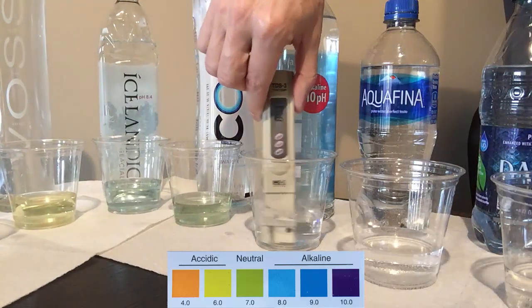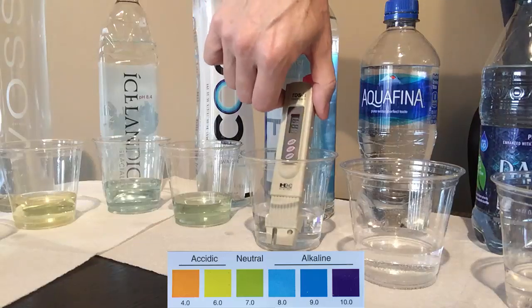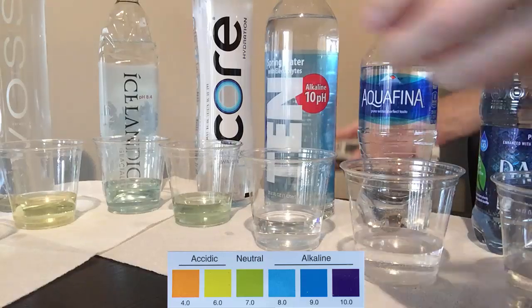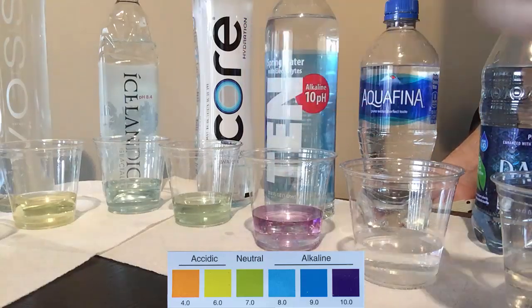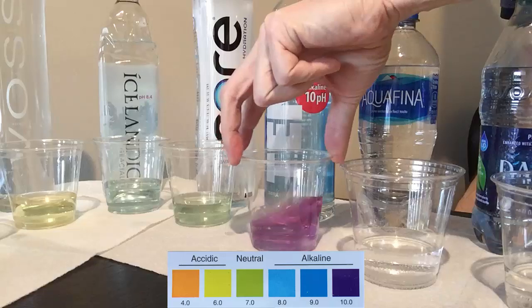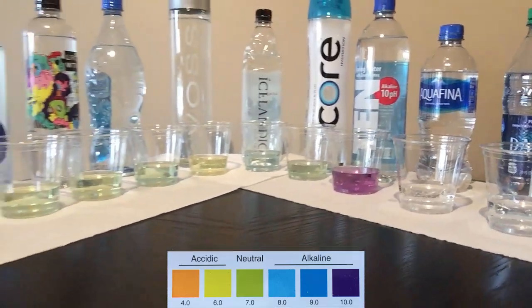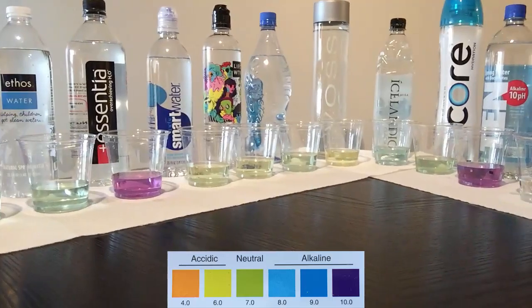10 is a spring water that claims the highest pH of them all — at 10, hence the name. With a TDS at 87, the pH level of this water is definitely purple, probably 9.5, possibly 10 — a bit darker than Essentia.